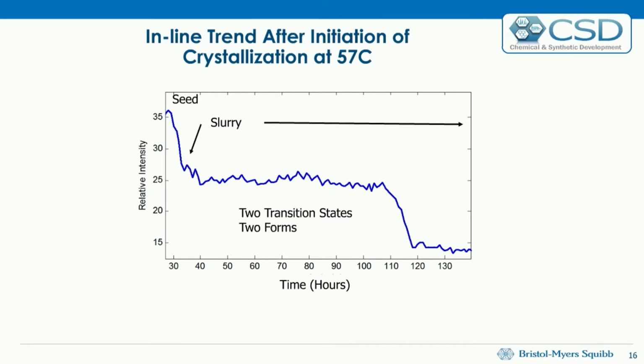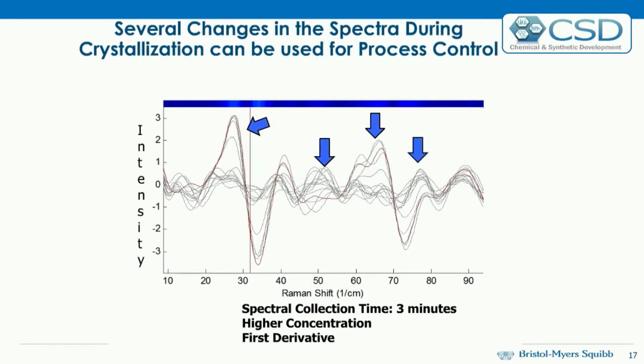The point is we're watching this change in the low frequency. You let it go long enough, and there's a secondary transition. So this was what indicated to us, based on indomethacin, and what you see here, is that we have to make sure that we do long enough studies to ensure the crystalline matrix. And I have another example where we saw these changes that were unexpected over time. So it's a nice example for us to monitor for the future.